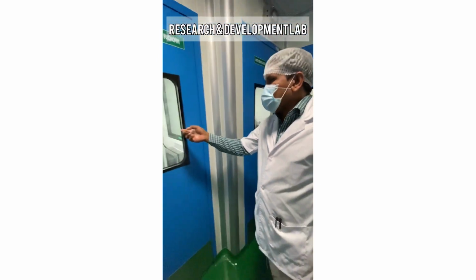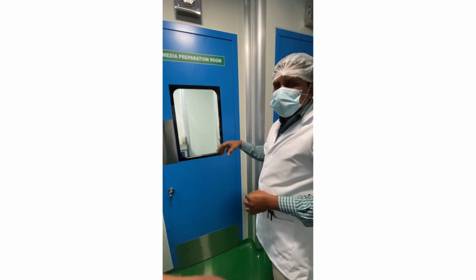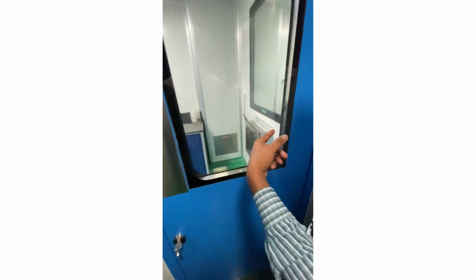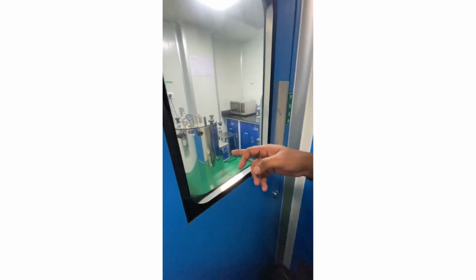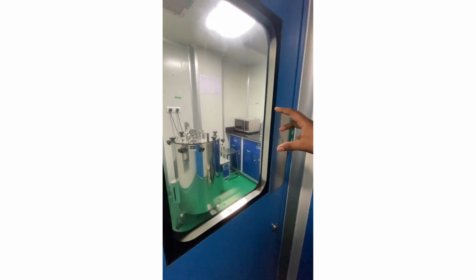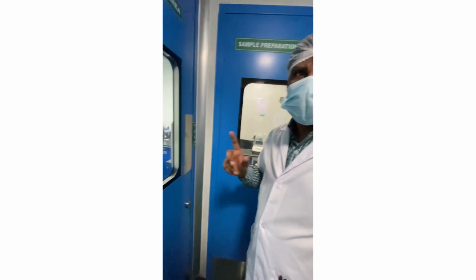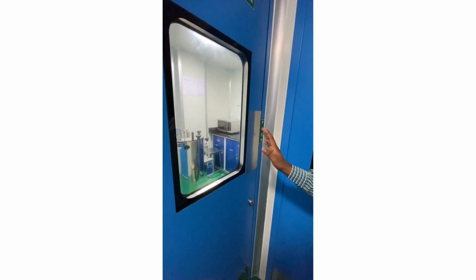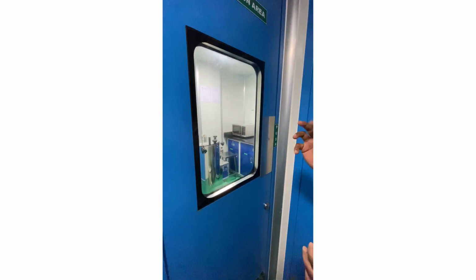This is the media preparation room. Here we are preparing the media, analyzing the samples now. First we prepare the media, and from this room there is a pass box. After preparation, through that pass box, we take the media here for the sterilization process. We sterilize glasswares, media and all in this sterilization at 121 degrees centigrade, 15 lbs pressure, to kill all types of microorganisms, which we use to cultivate the organism of the product.